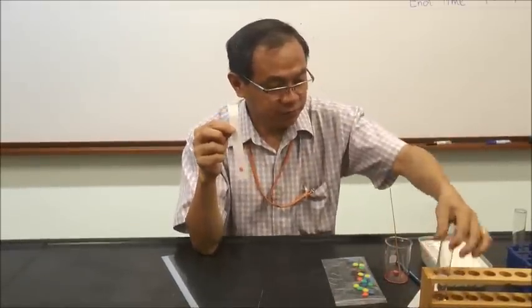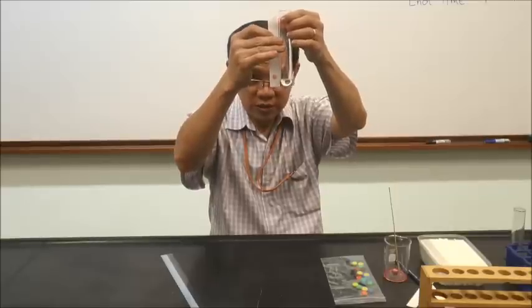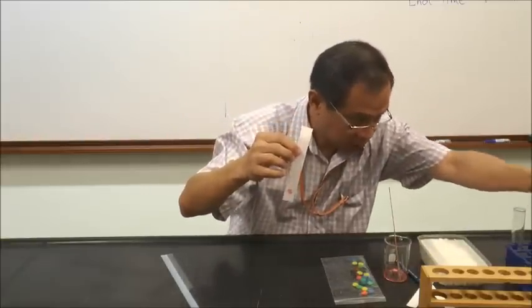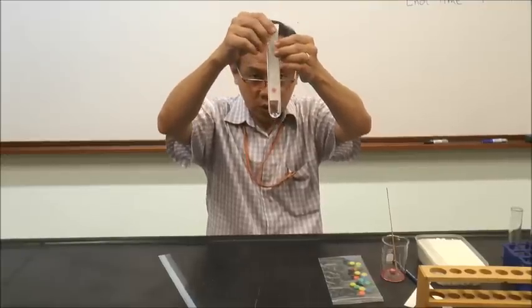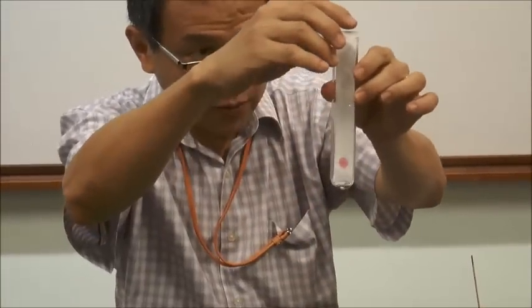And this is the boiling tube. Your water shouldn't be too much, that would cause the coloring to be submerged. So I'm going to pour away a bit of the water, just about 1 cm height, so I can put it inside slowly. The coloring should not be submerged, just enough that it touches the chromatography paper. Then you just need to leave it after you have put it in. There's no need to agitate.